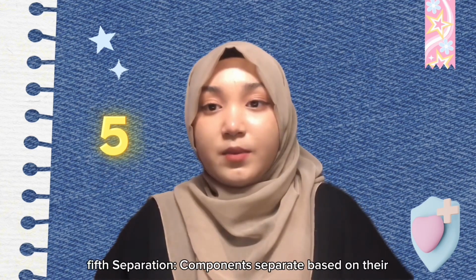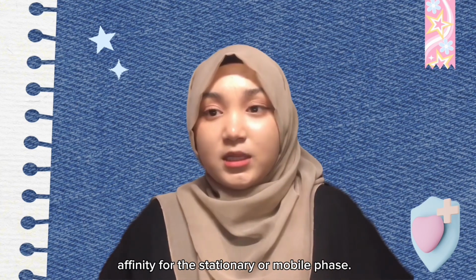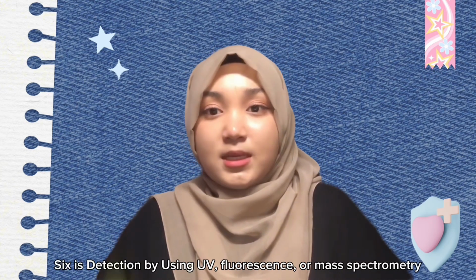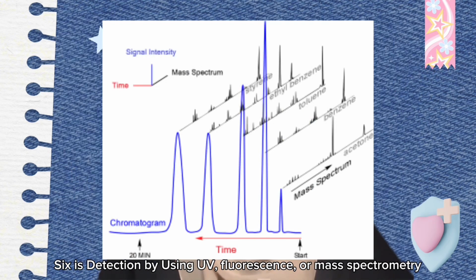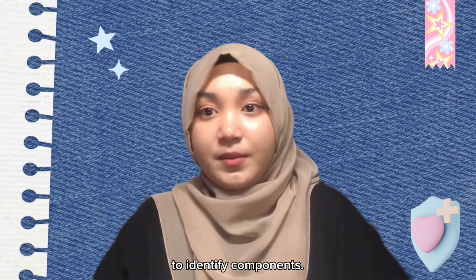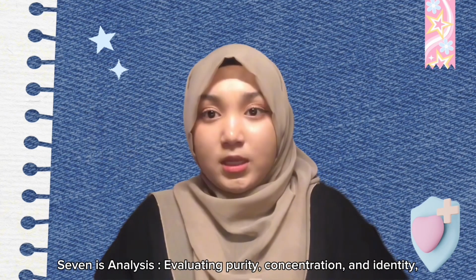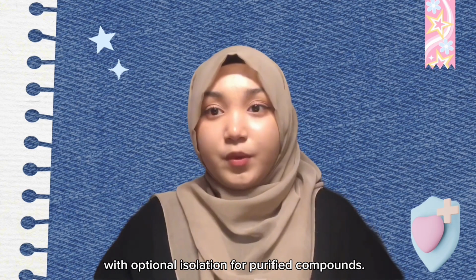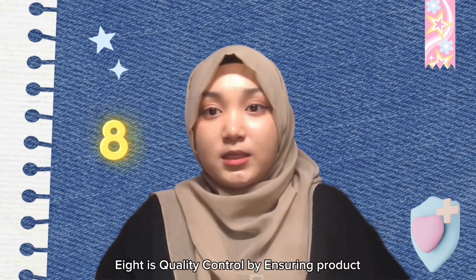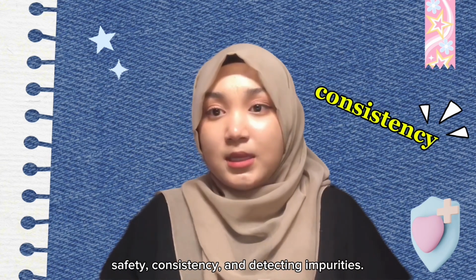Fifth is separation. Components separate based on their affinity for the stationary or mobile phase. Sixth is detection, using UV, fluorescence, or mass spectrometry to identify components. Seventh is analysis, evaluating purity, concentration, and identity, with optional isolation for purified compounds. Eighth is quality control, ensuring product safety, consistency, and detecting impurities.